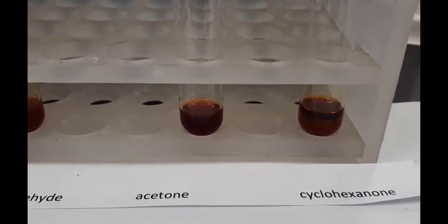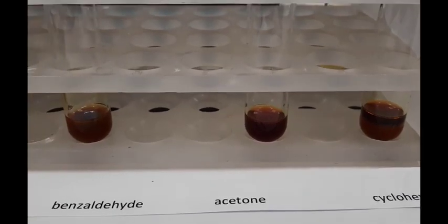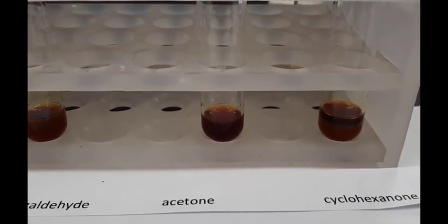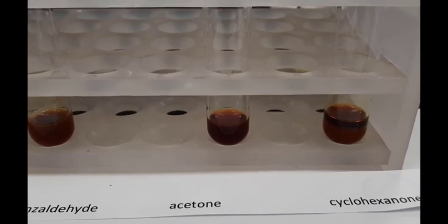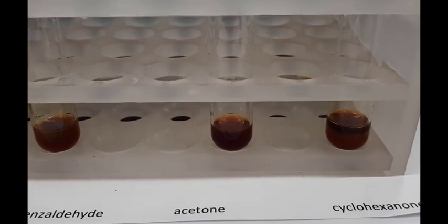Now, pay careful attention to the cyclohexanone, and you notice that the cyclohexanone clearly exists in 2 layers. And that is because cyclohexanone is not miscible with water. Recall that the iodine solution is mostly water, so that split into 2 layers indicates that it's not soluble.